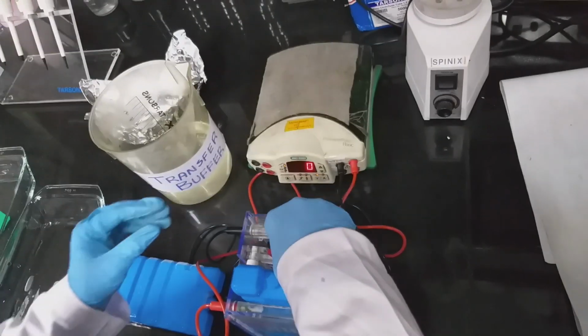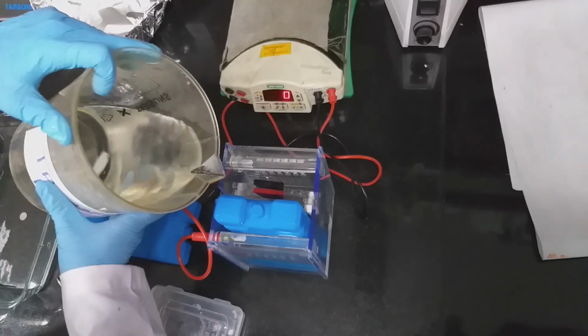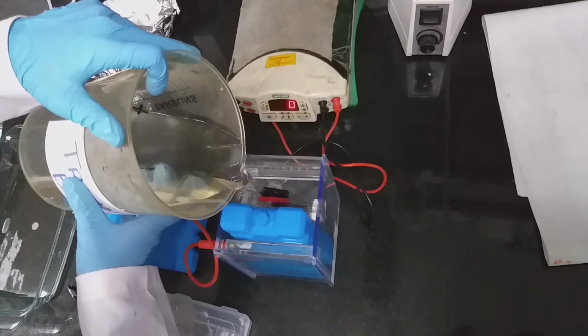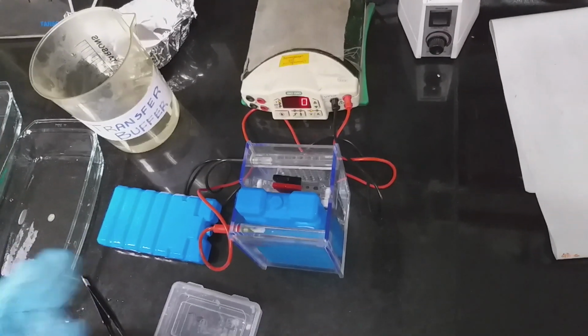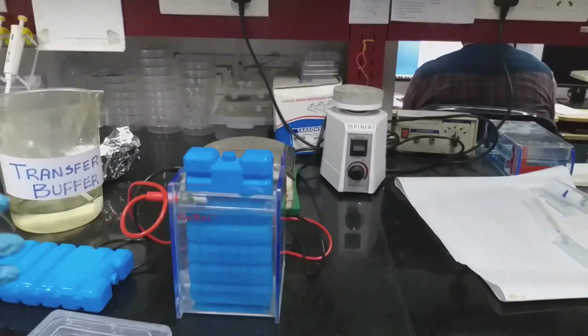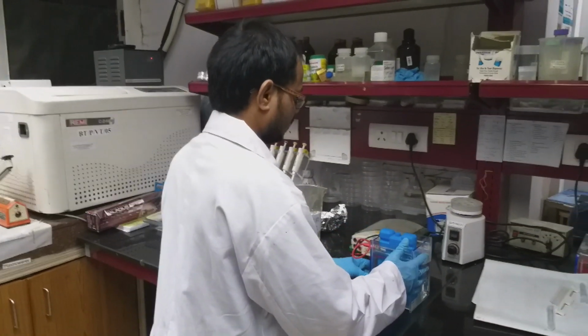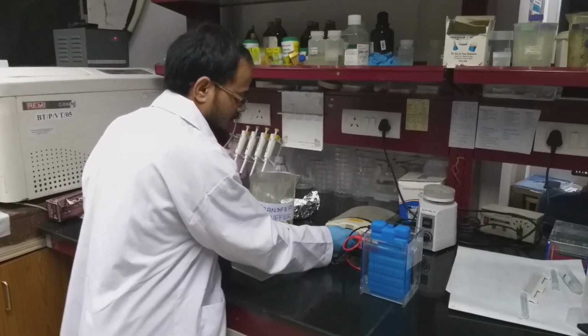If there is buffer insufficiency, you can add more on top. Make sure the cassette is completely submerged so that the transfer will be proper and there are no air bubbles. Once the setup is over, now you can transfer.